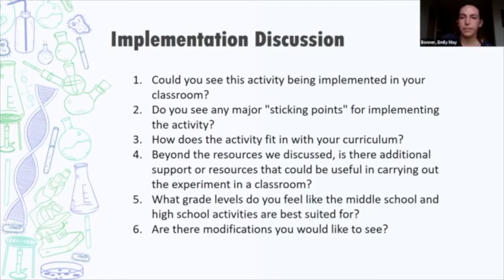So one quick question I had is, when students are doing that data observation, they've fixed their toxicants, they've made their dilutions, and they've set the experiment up. Now they're looking at collecting that data. How do they determine, I assume they're looking for just germination, correct?